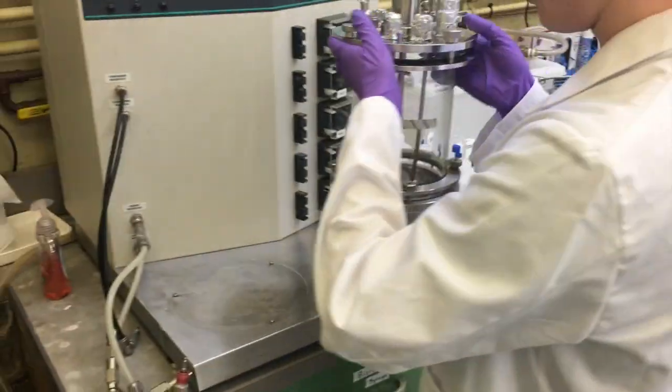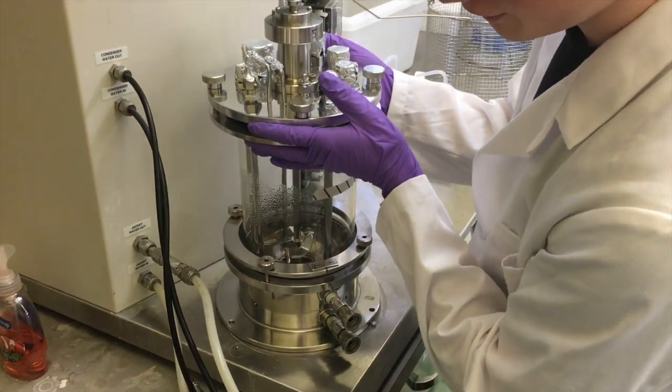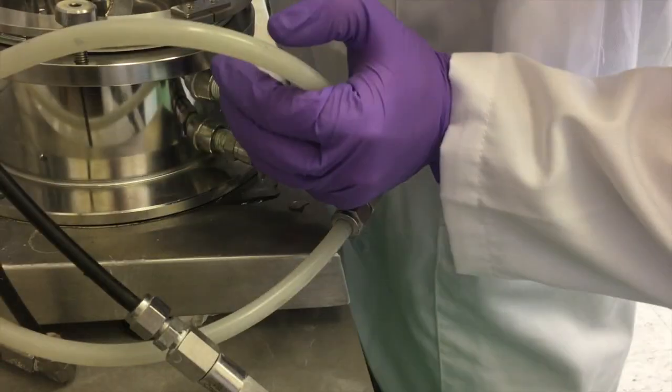Place the reactor on the control system. Attach the inlet and outlet water tubing for heating the reactor.